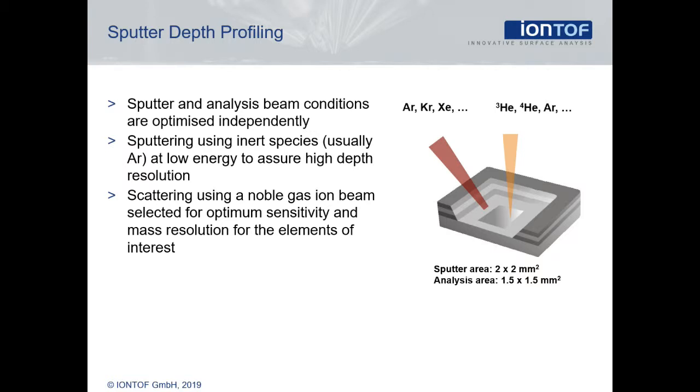Just as in other surface analytical techniques, LEIS analysis can be done while a second low-energy ion beam creates a sputter crater. While sputtering, surface spectra are acquired from the receding surface in the crater, forming a depth profile. Using separate beams for analysis and sputtering allows the operator to optimize the ion beam parameters for each task.